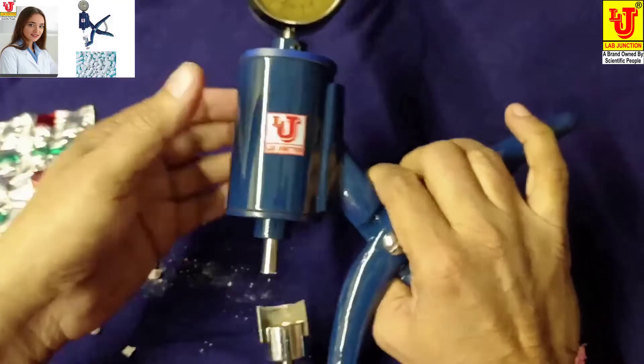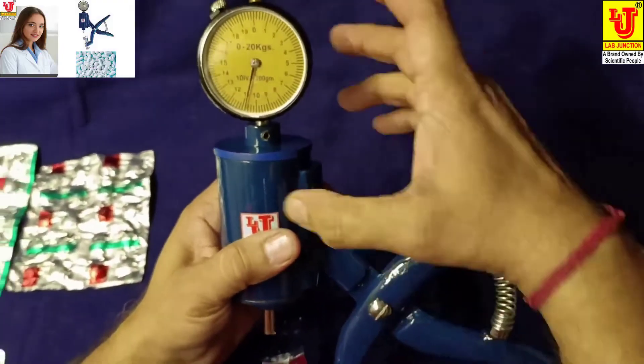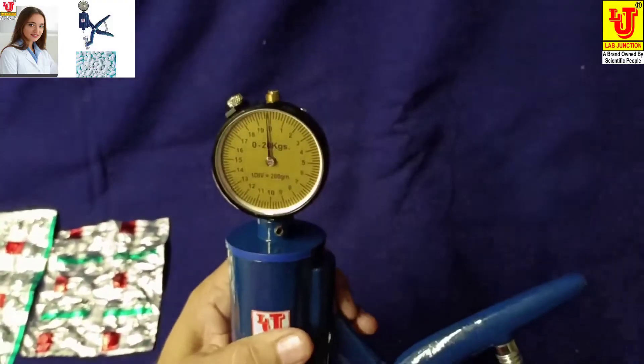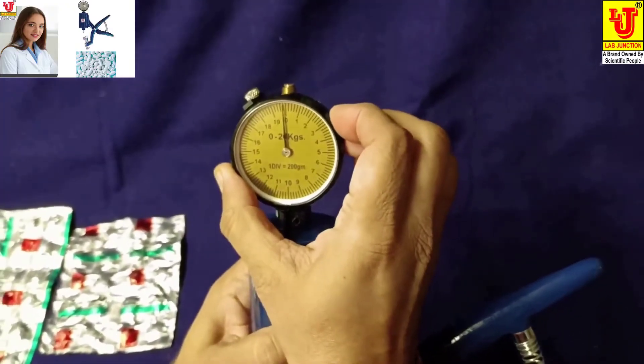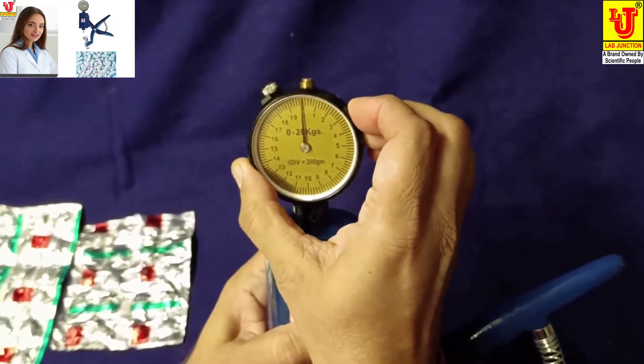When you take another sample, first you have to set zero like this. Adjust the mark to zero position.